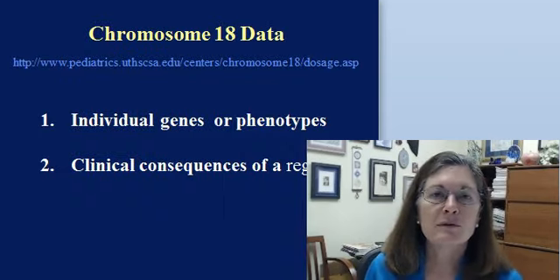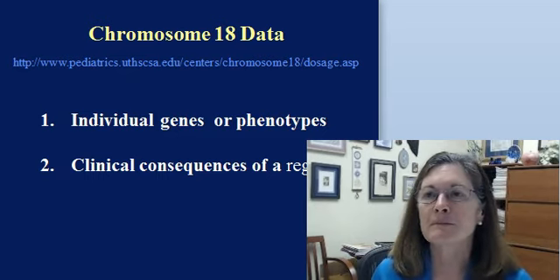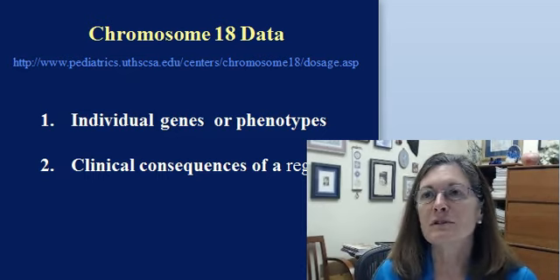So that's how to use the UCSC Genome Browser. The most important thing is to start with hide all, so you don't even have to look at all that other data that has no clinical relevance. And now that you know how to do that, you can use our gene dosage maps.